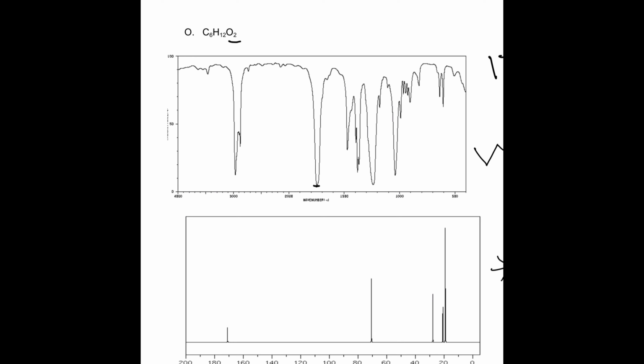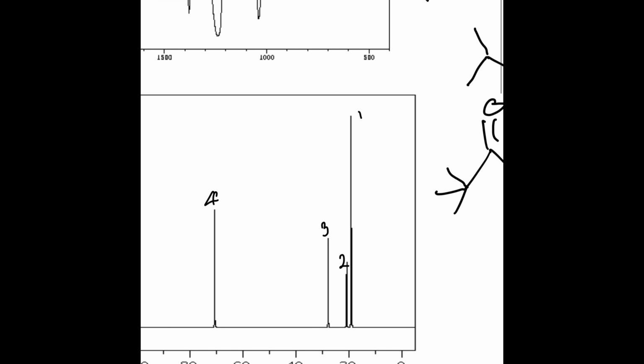Yeah. So now just taking a look at, again, this carbon-13 NMR spectrum here, we see the peaks here, 1, 2, 3, 5 peaks here. We're just going to start on this end. Looking at these peaks, we see that this first peak is 20. These first 3 peaks actually are between the 20 to 40 ranges.